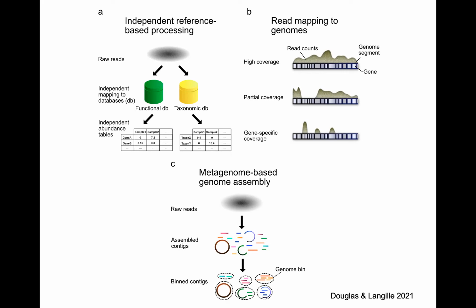You might want to say, can we find new Blastocystis genomes? And you can use mapping to say, okay, what regions of this genome are covered? Do we possibly have a new strain or something? Or is this a variable region within this genome that gets excised, and so it may represent like a genomic island or something? So yeah, it's much more targeted usually on a per species level that you're interested in.